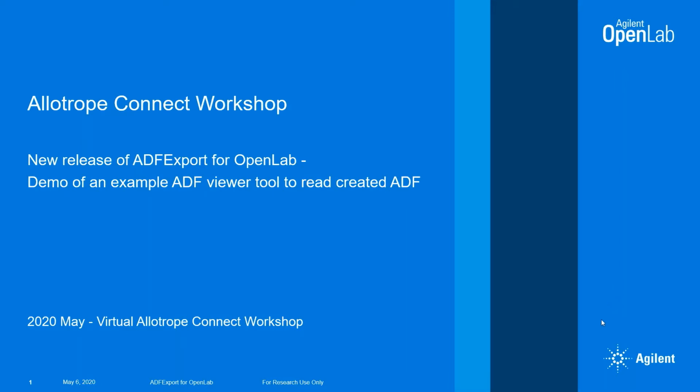We are splitting this presentation into 3 parts. So you can take the next slide, please.